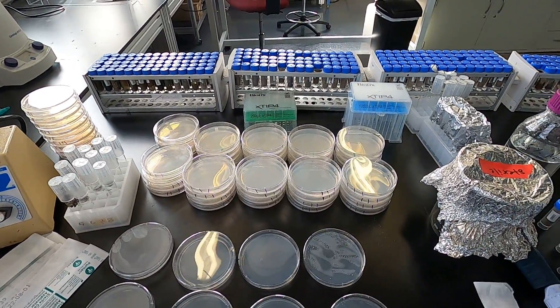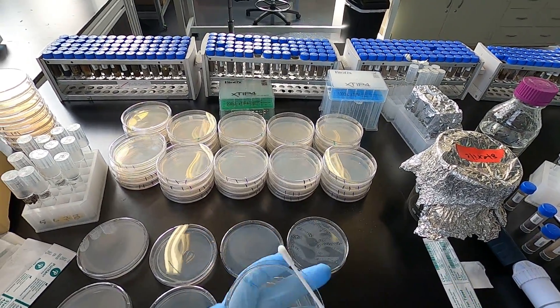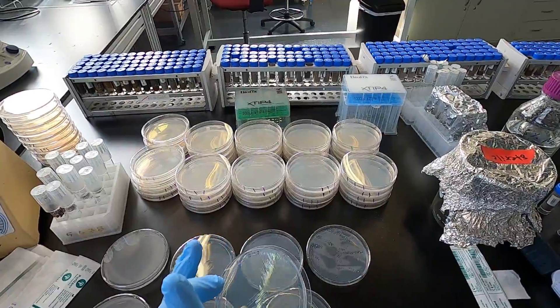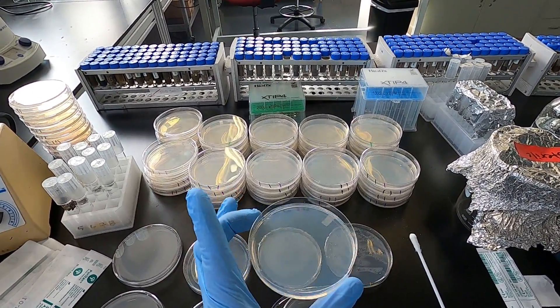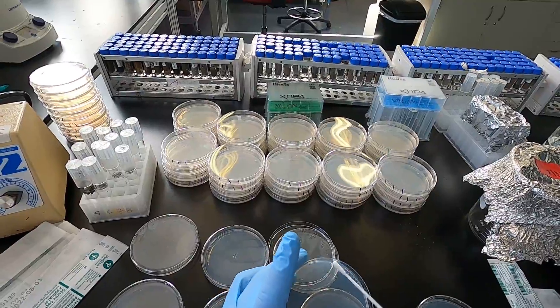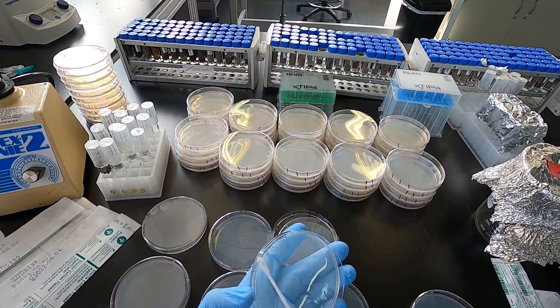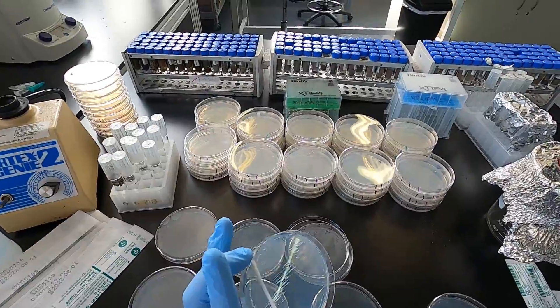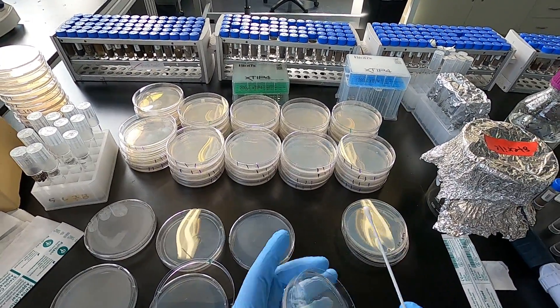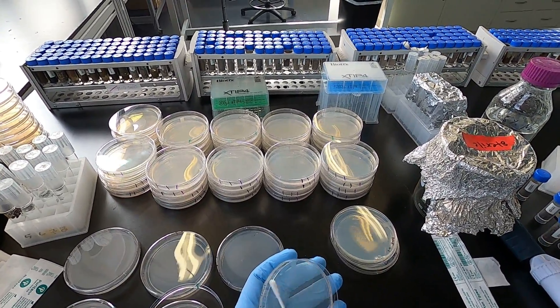I'm going to grab a cotton swab. Make sure you open it from the back end. Then you just swab. Rotate the plate 90 degrees multiple times to get full coverage. If you angle the plate, you can see that you've covered everything. If you start at the low dilution, you can keep the same cotton swab tip and move up, because the number of cells you're going to carry over is not that much.